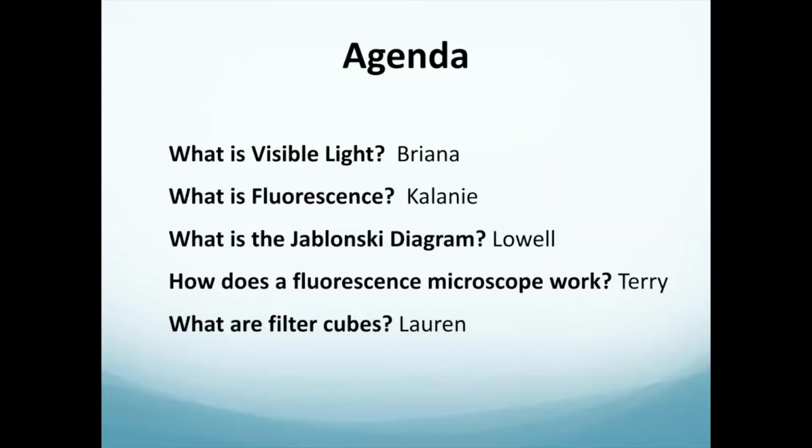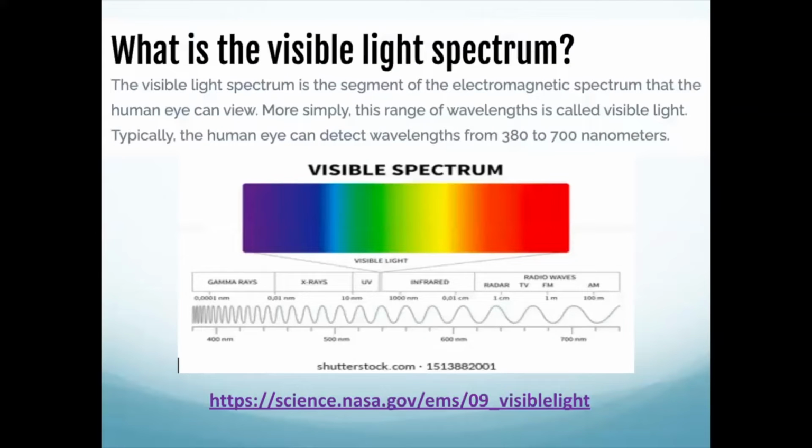And on the agenda today, Brianna will be talking about what is visible light. Kalani will be talking about what is fluorescence. Lowell will be talking about what is the Jablonski diagram. Terry will be discussing how does a fluorescent microscope work. And Lauren will be discussing and identifying what are filter cubes. So up next, we have Brianna Wing, who will be discussing what is visible light.